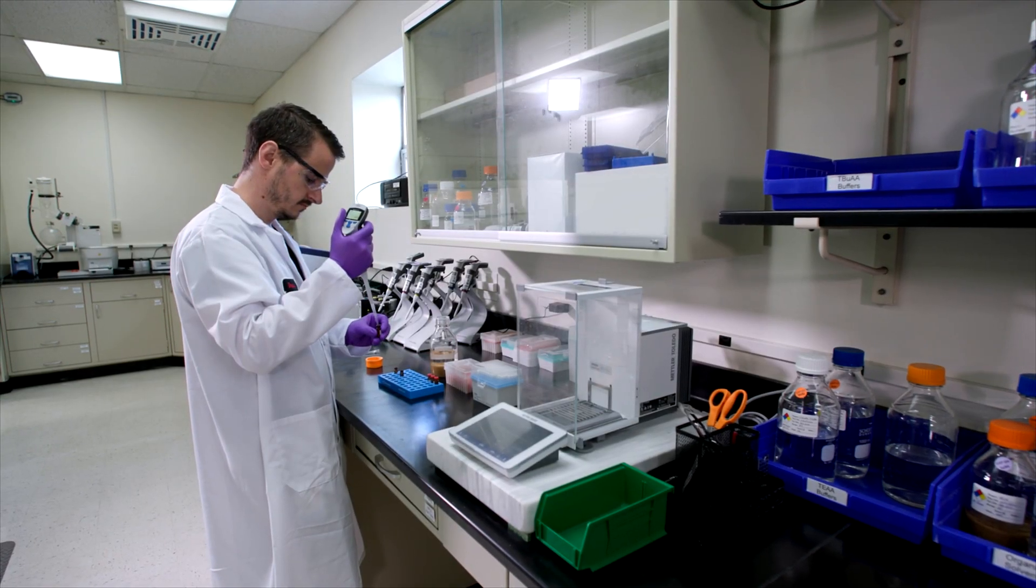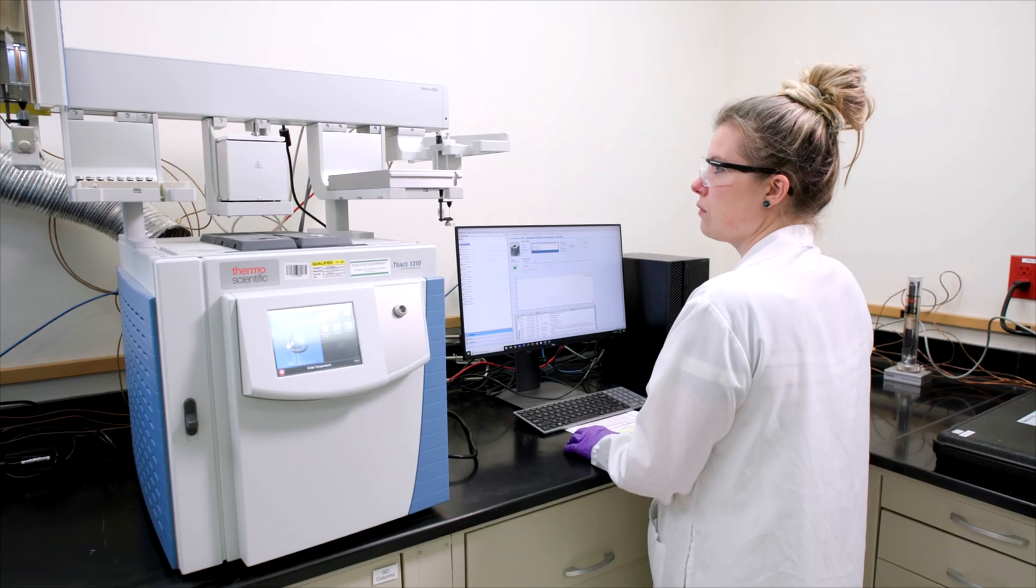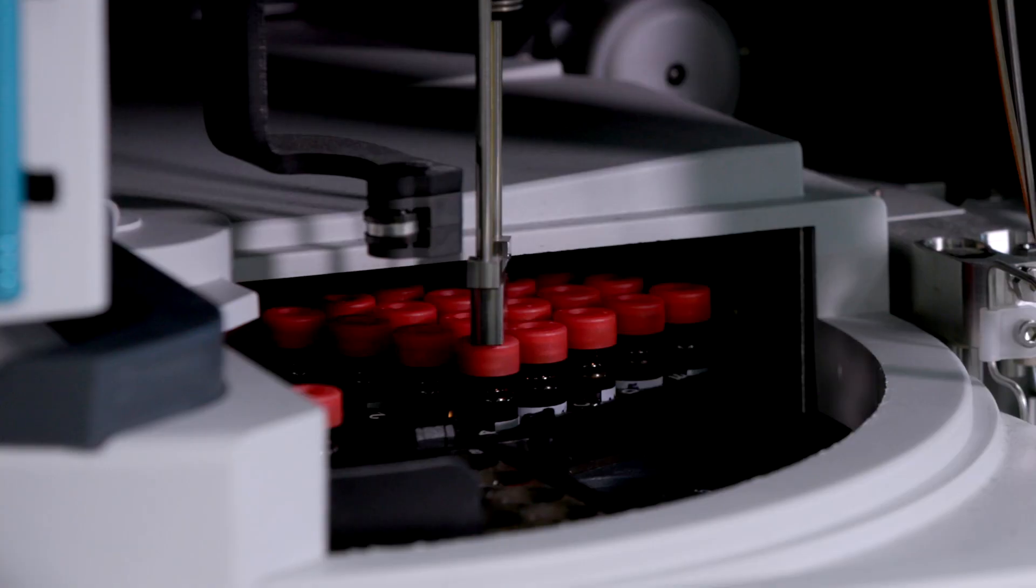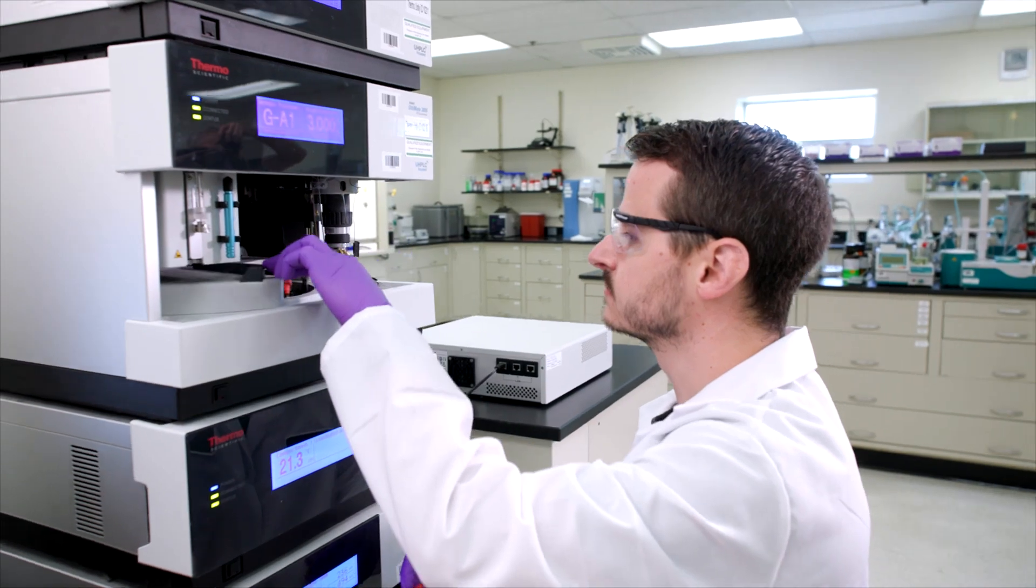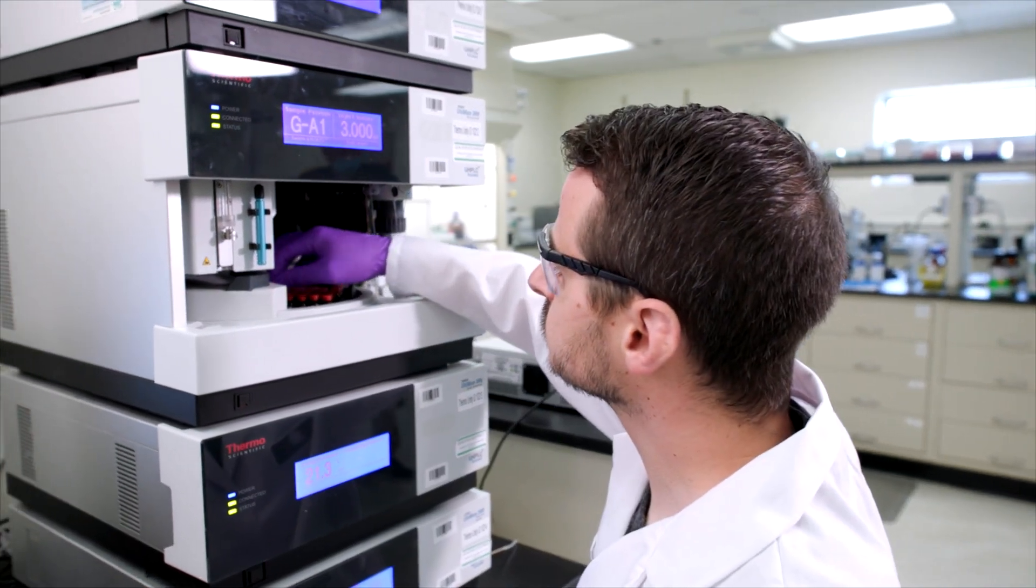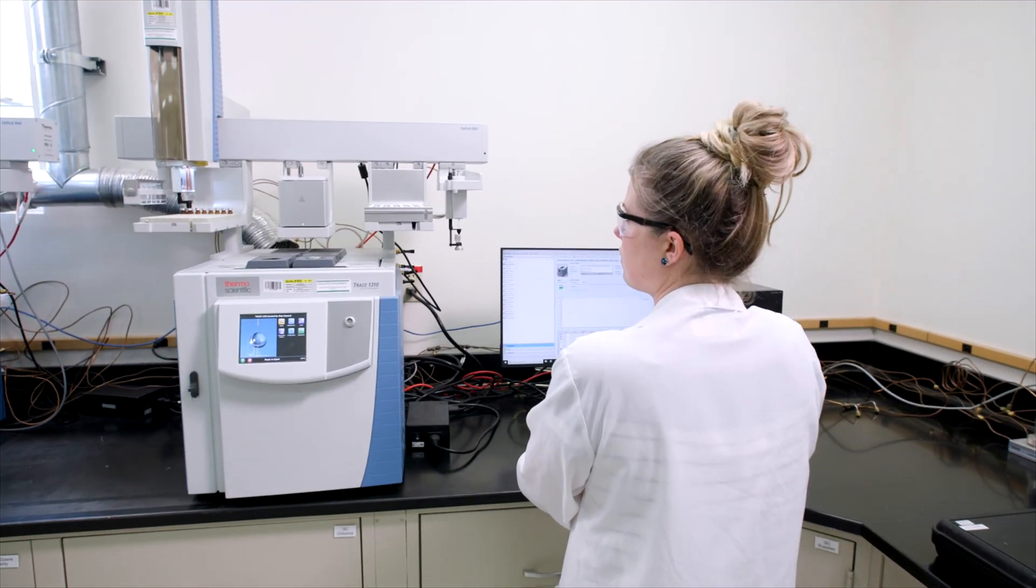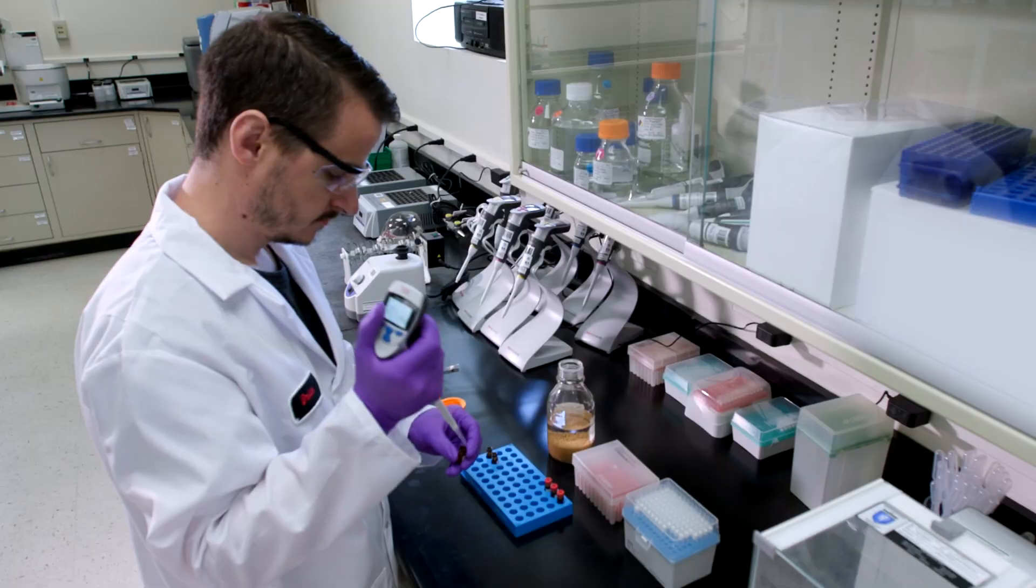To help ensure our products meet your required specifications, our Milwaukee facility is ISO 9001-2015 certified, which has been refined over decades of partnerships with customers like you since its implementation in 1995.